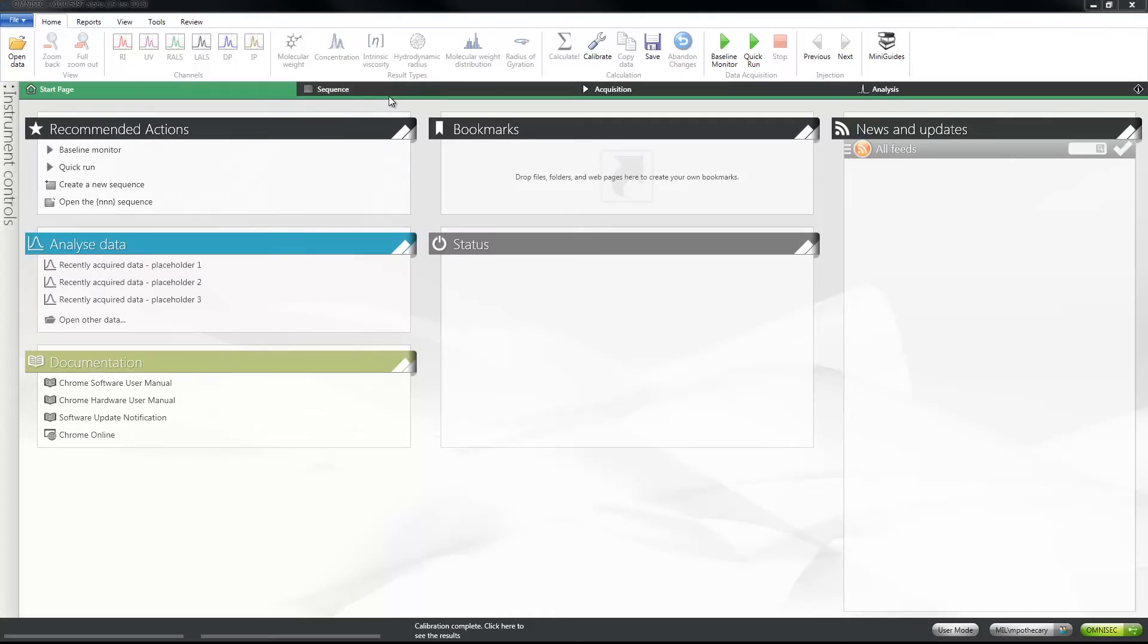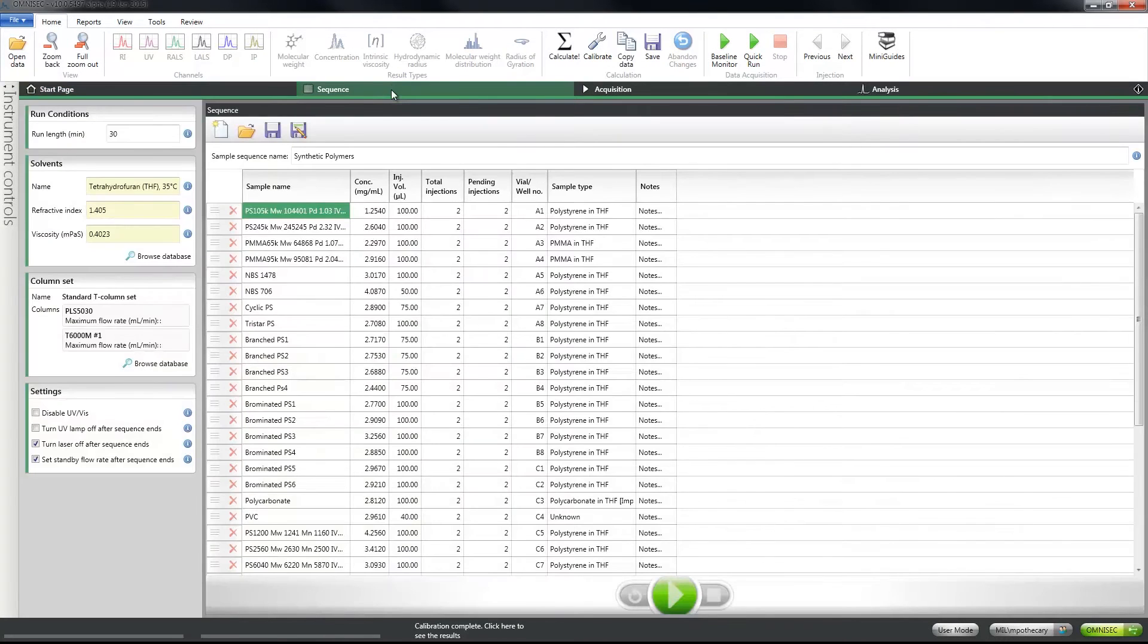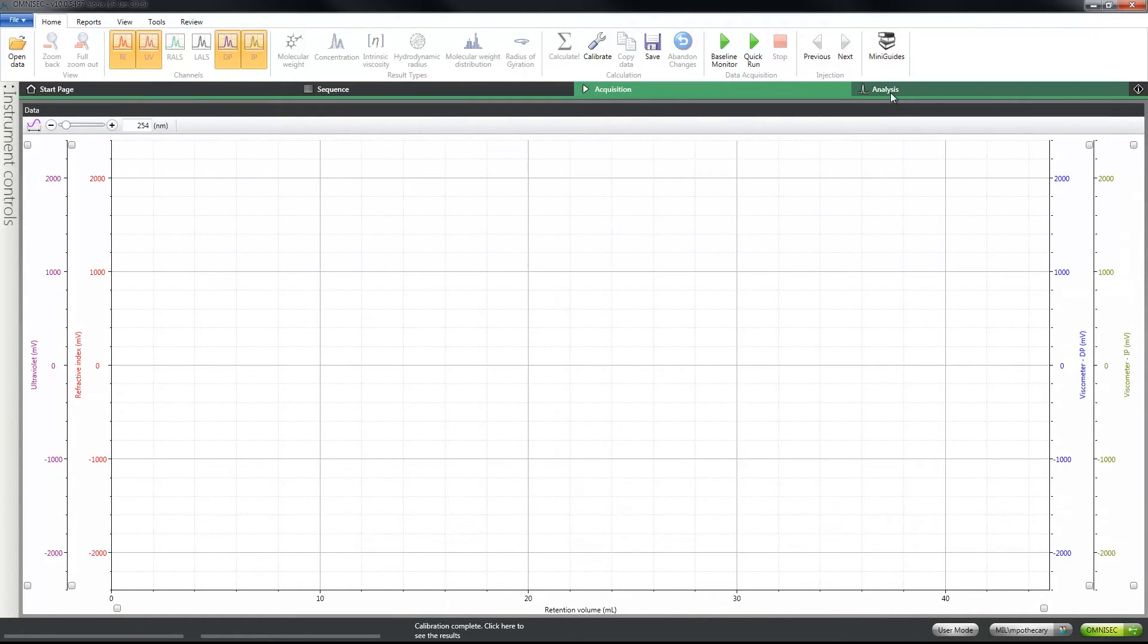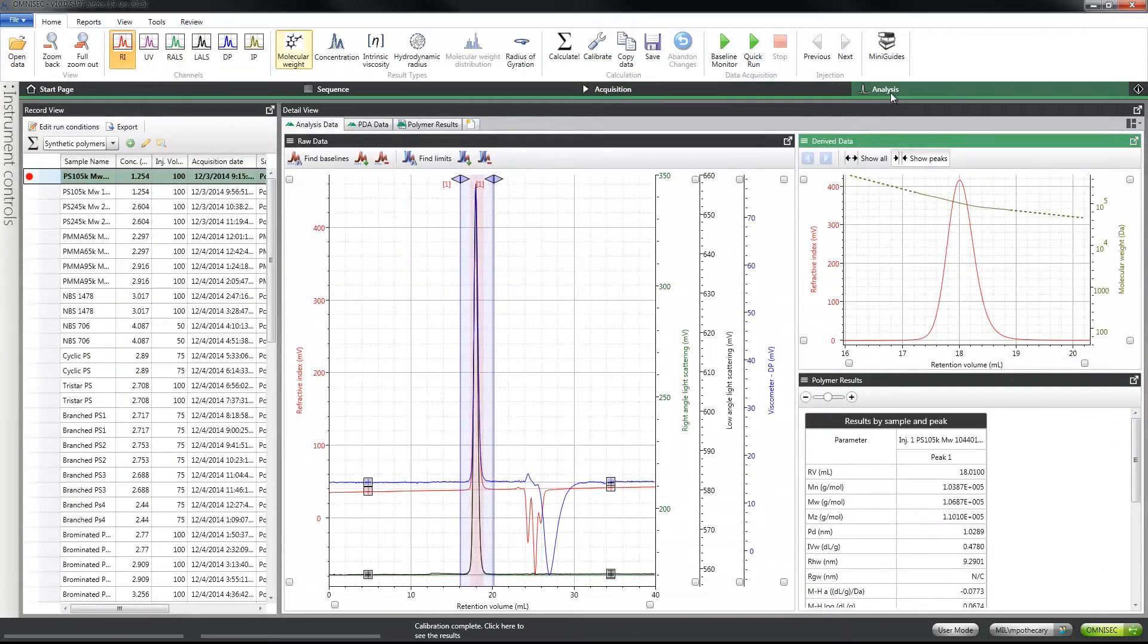Omnisec Software version 10 has been written specifically for the new Omnisec system and controls everything from data acquisition through to analysis and reporting using a simple workflow-based design.